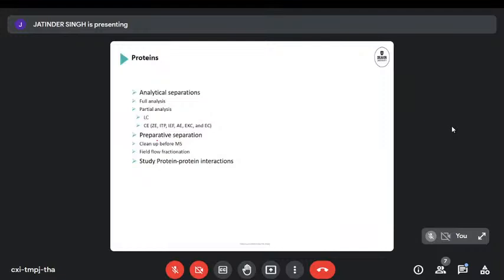A third thing that's done with proteins is studying how they interact with other molecules, other proteins, drugs, DNA. There's a whole field of study out there as well. So perhaps more so even than with DNA, there's a lot of different experiments, a lot of different researchers, from biophysics to biotechnology, medicine, all different reasons of working with protein. Again, substantiating why we just get a little bit of a cherry out of different baskets this morning, how microfluidics can actually help some of that work.